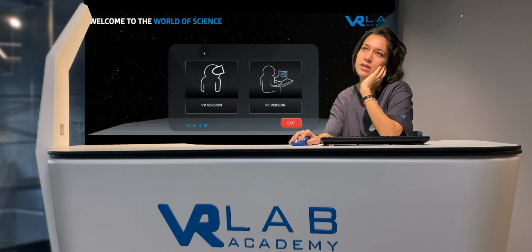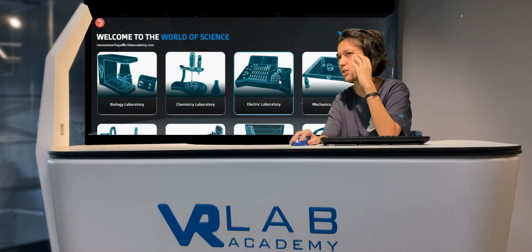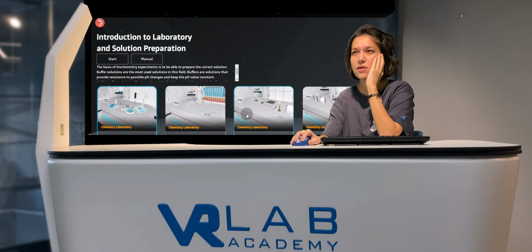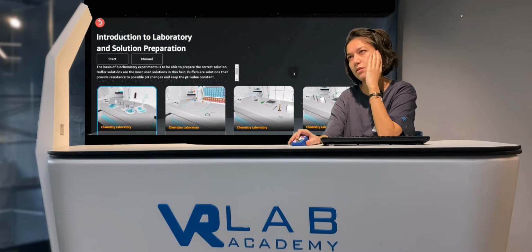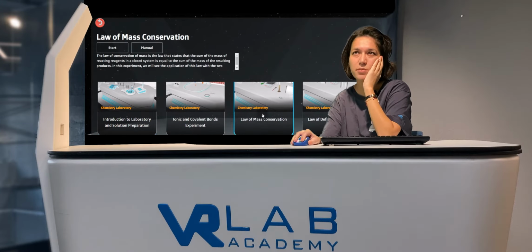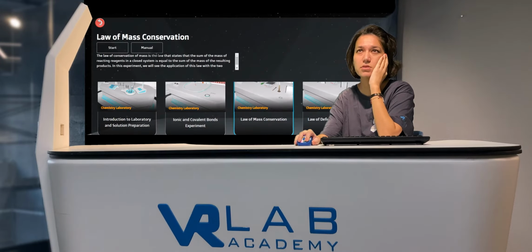After signing in using our username and password, we select the PC version because we use a PC, and we select the chemistry lab because this is a chemistry experiment. We find our experiment, and we can access the manuals using the manual button, or start the experiment and select English to continue.